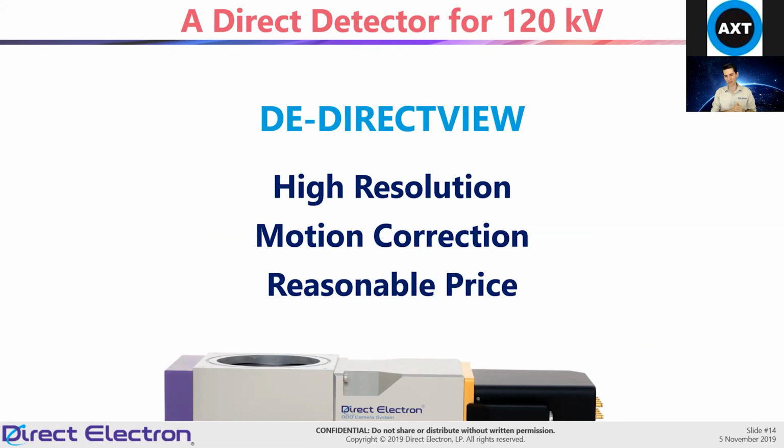So I see a question, have we tried a 120 kV tungsten filament? The answer is yes. The big problem with tungsten is it's really, really incoherent, and we have not had good results with tungsten. You pretty much have to have LaB6. It's just, tungsten is pretty bad. We actually have a camera that we've been testing on a tungsten filament and have not had good results from it. LaB6 is pretty much required for a direct detector.